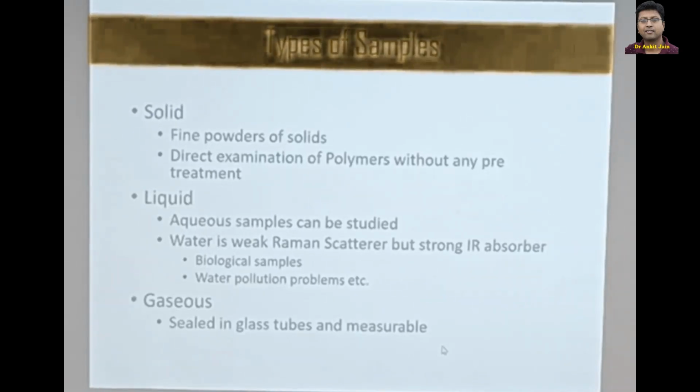And we can do liquid samples also. You can directly keep it in the Raman without burning the sample or changing its chemistry. The Raman will give its signal. So it's a non-invasive testing technique. The same sample I can use 10 times, even 20 times for Raman spectroscopy.